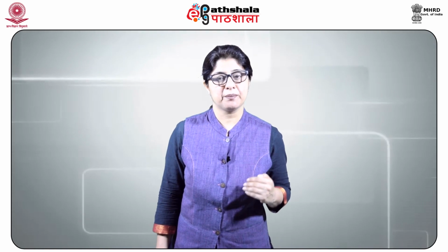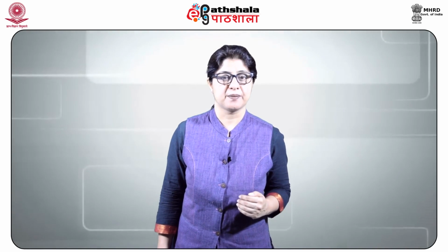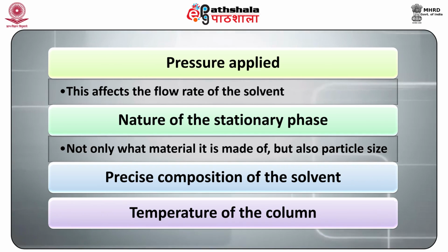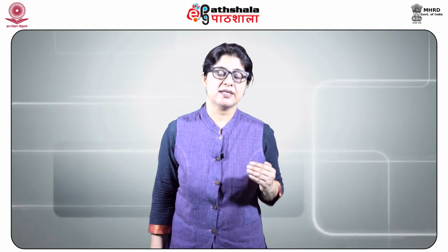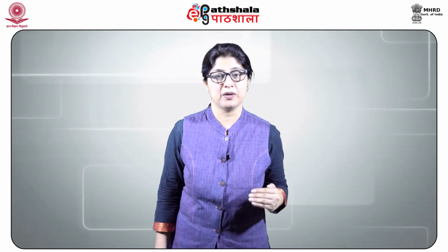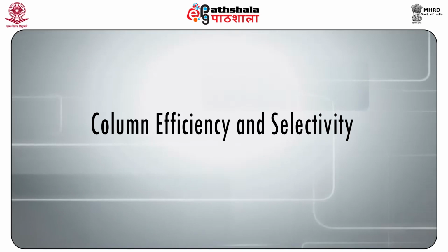For a particular compound, the retention time will vary depending on the following factors: pressure applied, which affects the flow rate of the solvent; nature of the stationary phase, not only what material it is made of but also the particle size; precise composition of the solvent; temperature of the column. This means that these conditions have to be vigilantly restricted if using retention time as the method of identifying the compounds. Column efficiency and selectivity.